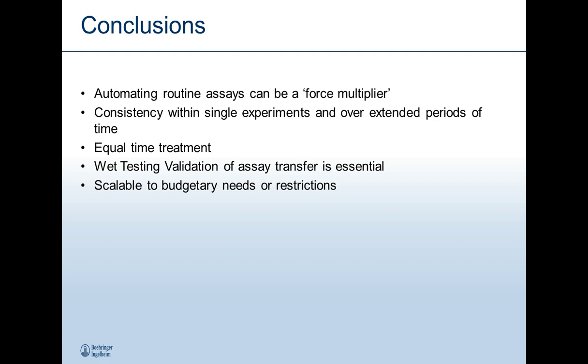When looking at how to implement any type of automation or workstation approach, I always advise people to keep an eye to the future and make sure that whatever they implement is scalable to future needs and also comes in line with your budgetary restrictions.